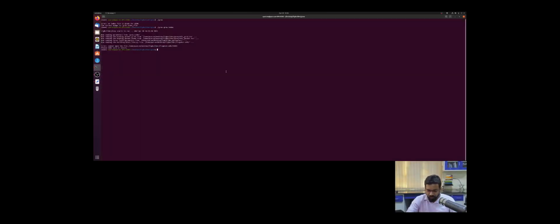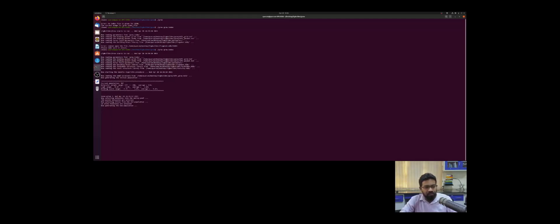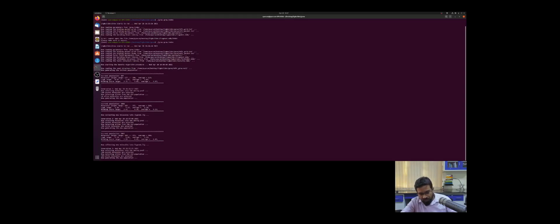Okay, we'll check whether the program is running or not. Yeah, it is running. Here you can see the program is now running and generating the population. It is a time consuming process because we requested the software to generate 200 novel ligand molecules based on the ligands which are satisfying the pharmacophore feature. So we have to wait for the completion. It may take some time.